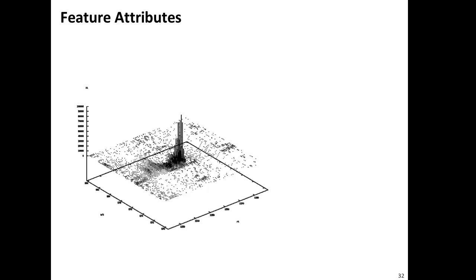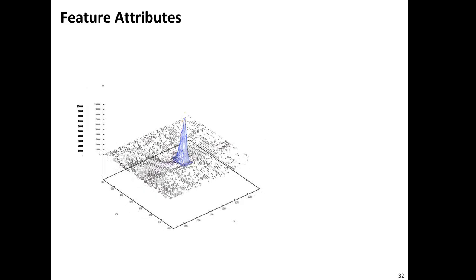Well, if we want to quantify it, and that's what feature detection is for, we need to reduce all the signal intensity of all the analytes that really come from the same analyte. We would like to replace that with a mathematical model that describes all the signal that comes from one peptide.